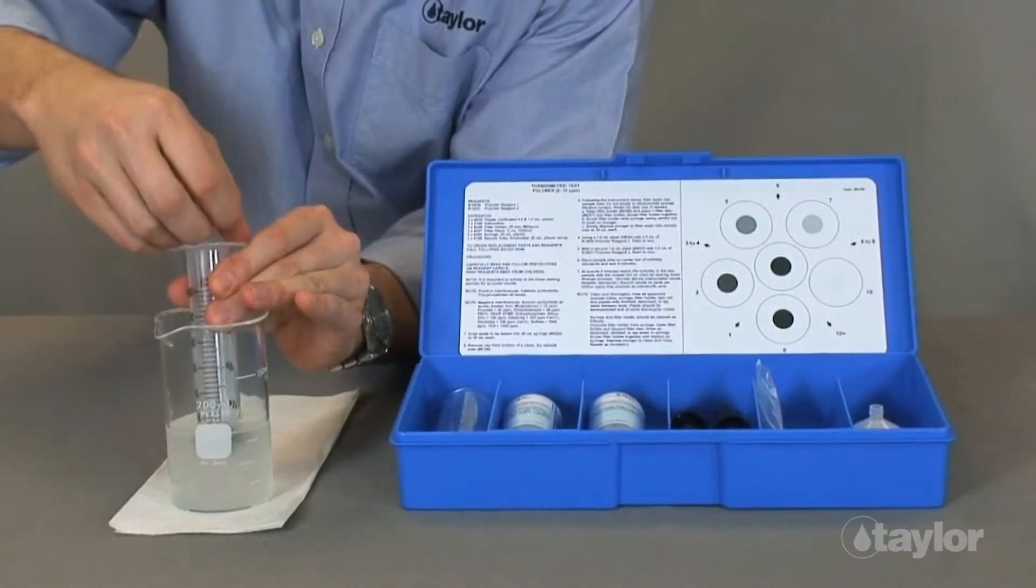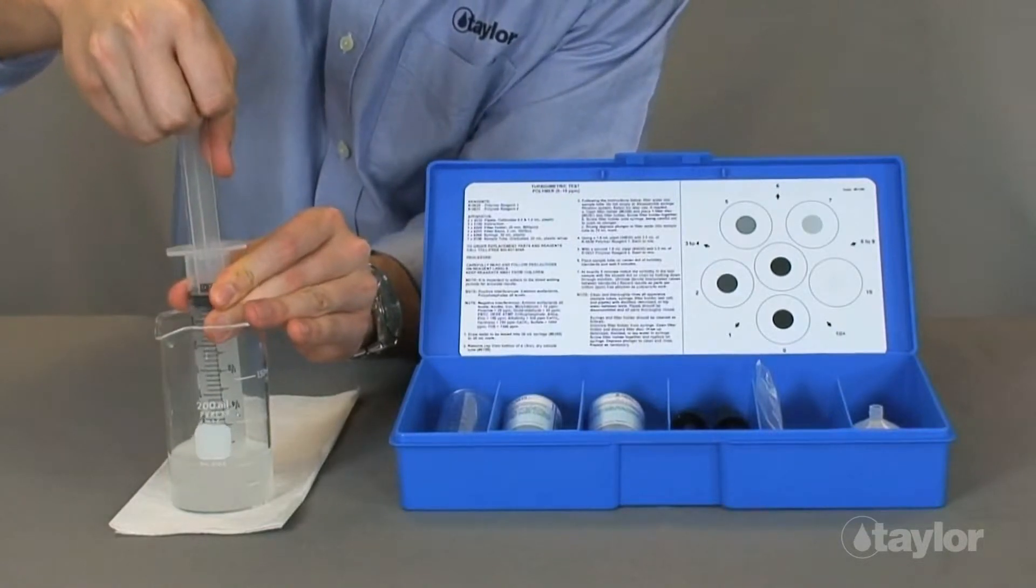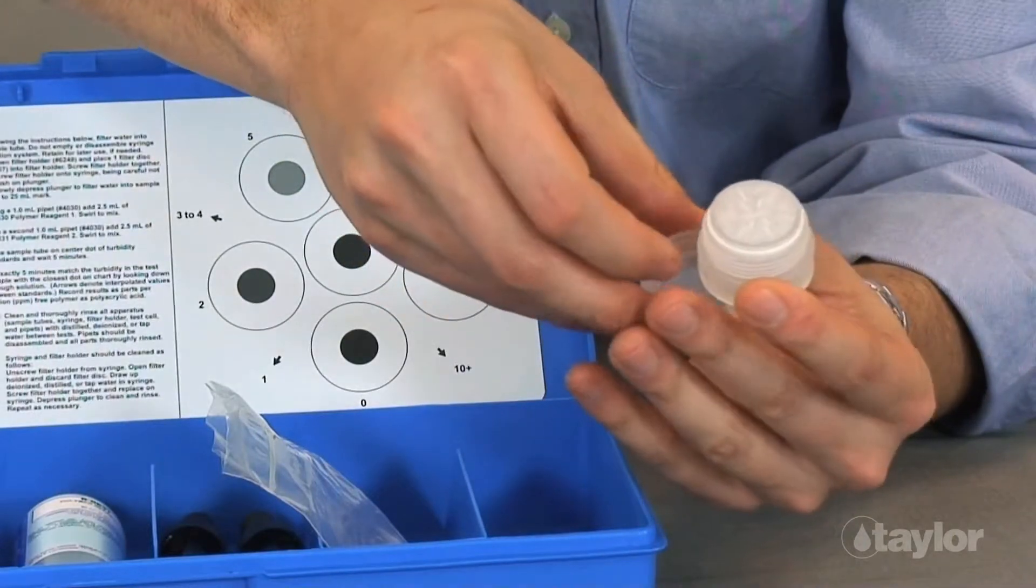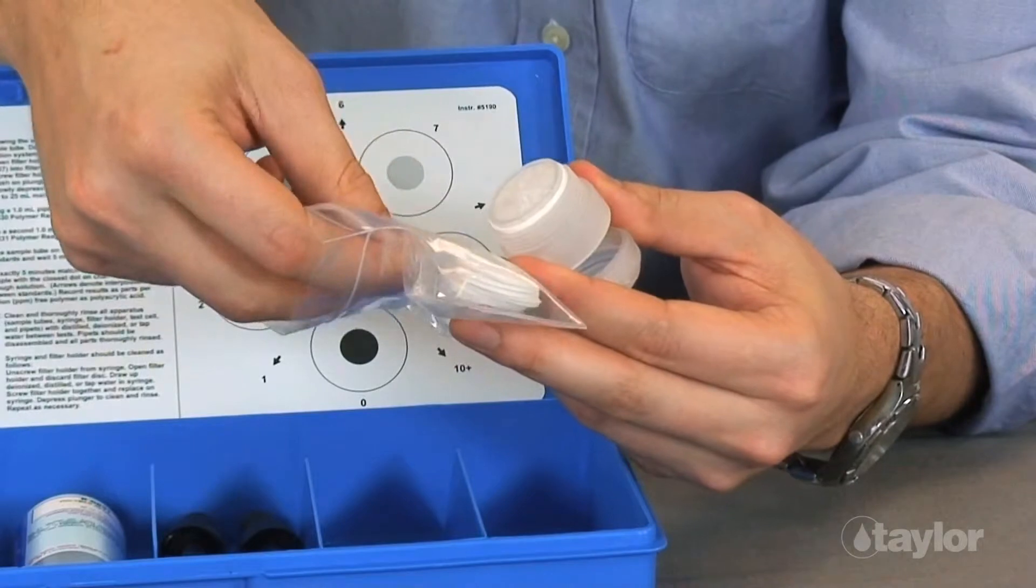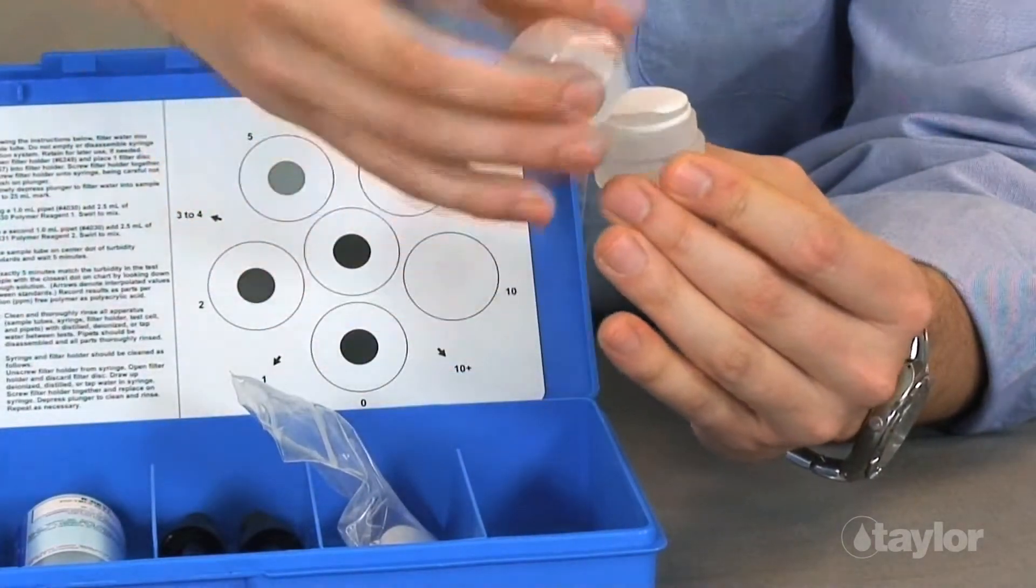Draw the sample water to be tested into the syringe filter to the 30 milliliter mark. Next, open the filter holder and place one filter disc into the holder. Close it.